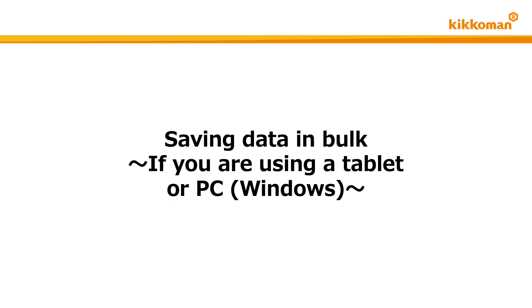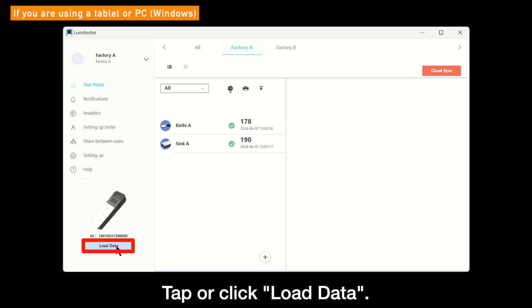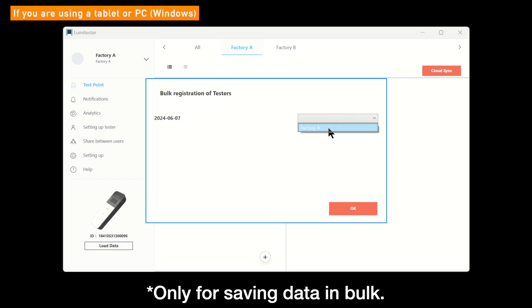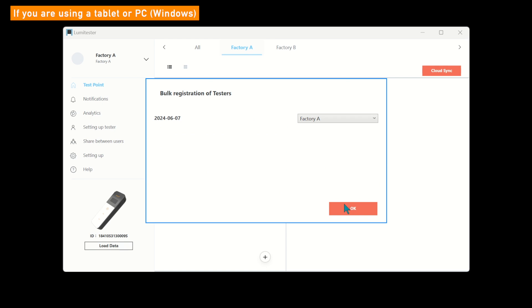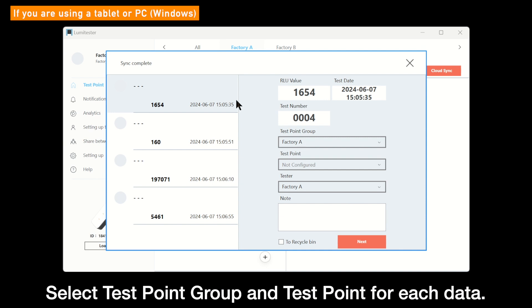It is also possible to test without connecting the Lumetester smart to the app and save the results later. Connect the Lumetester smart to the app and tap or click Load Data in the lower left corner of the screen. If you want to set the same tester information to the loaded results in a batch bulk, click or tap here and select a tester. Tap or click the OK button. The screen will change to Sync Complete.